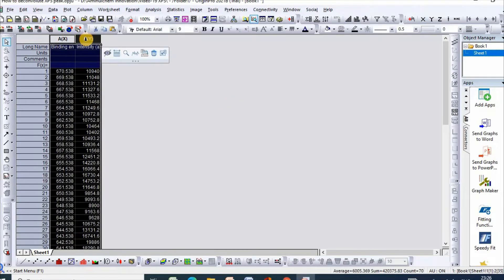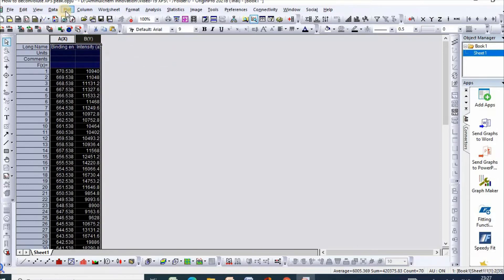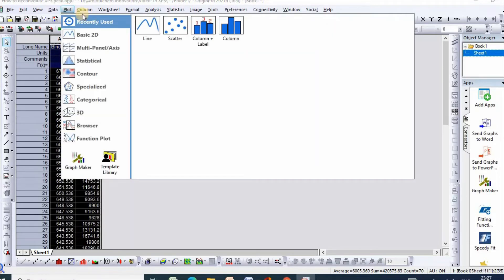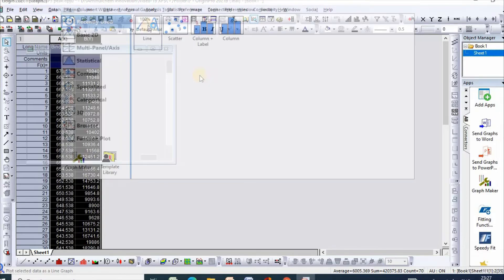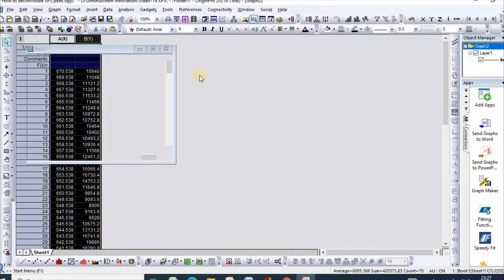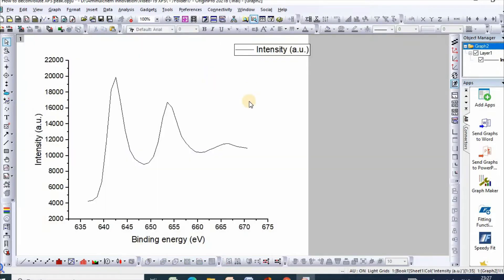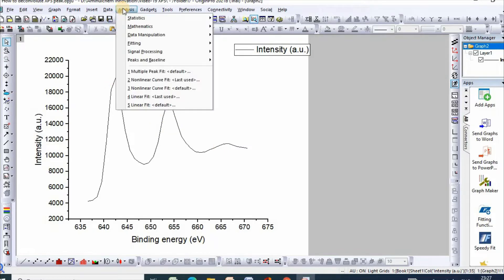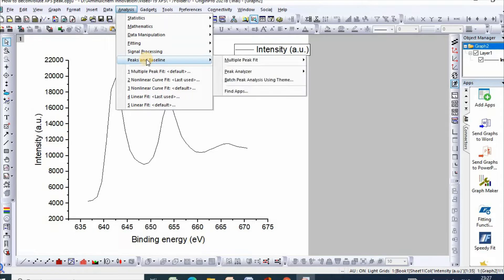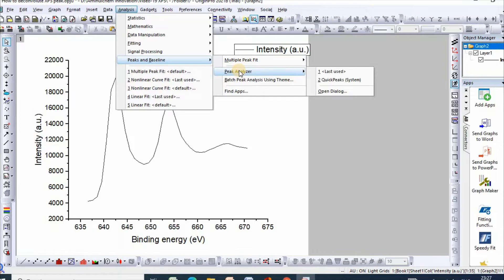Then select and click Plot, then select Line. So here is your XPS spectra. Then go to Analysis, then Peaks and Baseline. At first, you need to make baseline correction, then Peak Analyzer.